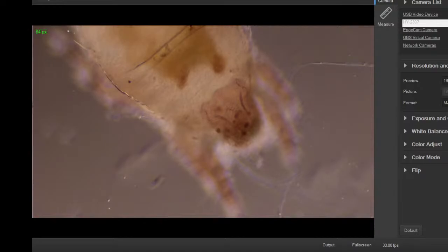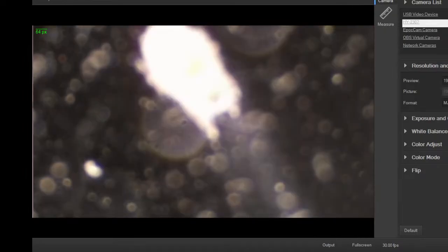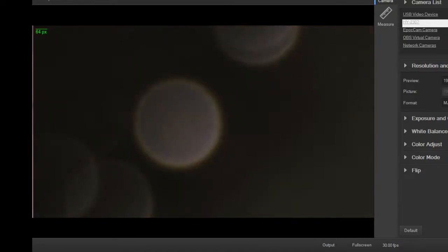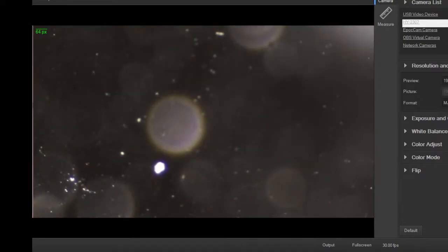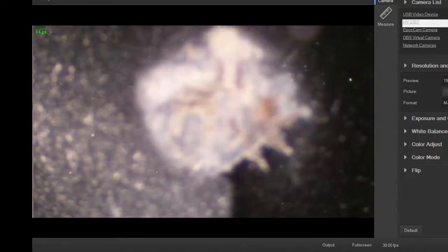I don't know if this will work, but I'm curious if I can get it to work. I'm going to try to flip the slide and see if I can see him from the underside. It's risky, but it might be fun to try. I might have to put another slide on it and flip it, which might also squash him a little bit more. We'll see. But I want to see what the underside looks like. Oh, there we go. Yeah, there's the underside.